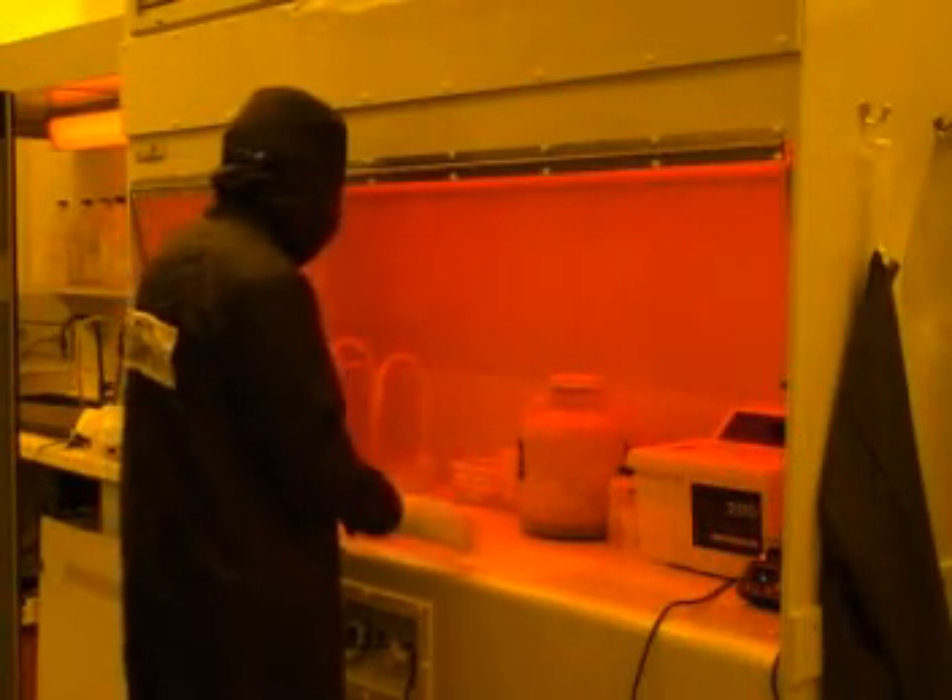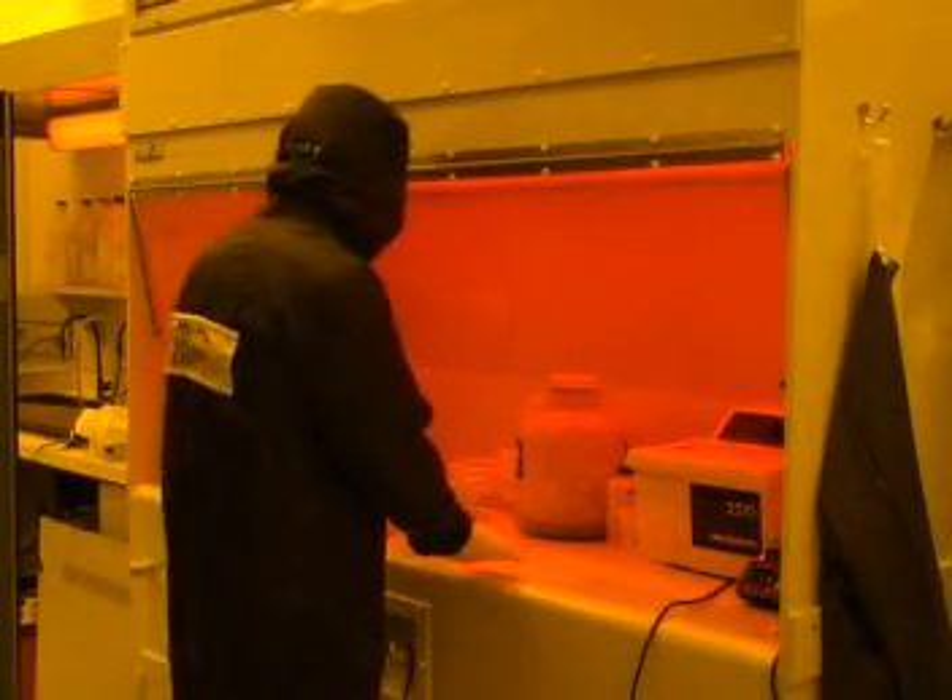A wet bench is available to users for the purposes of developing resist, cleaning substrates, performing a lift-off process, or any other reasons a wet bench might be required.